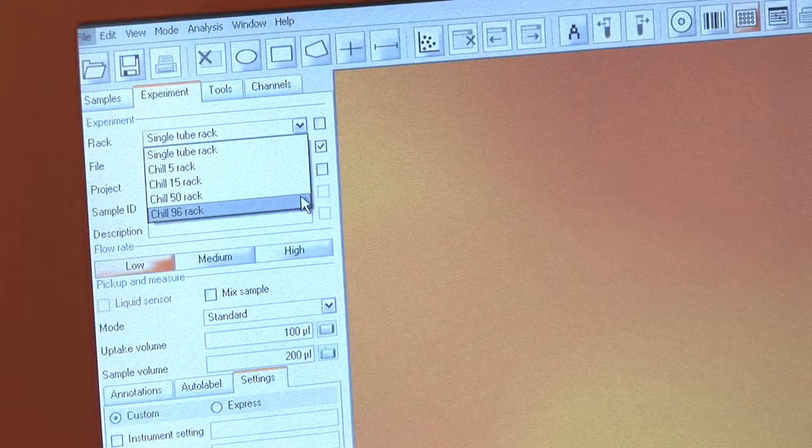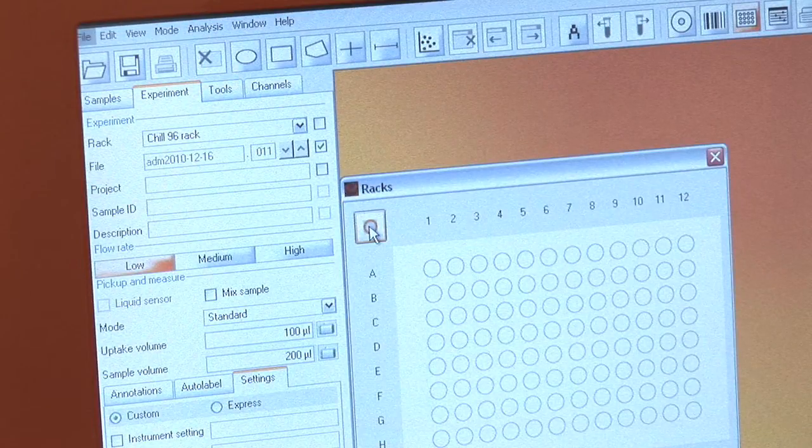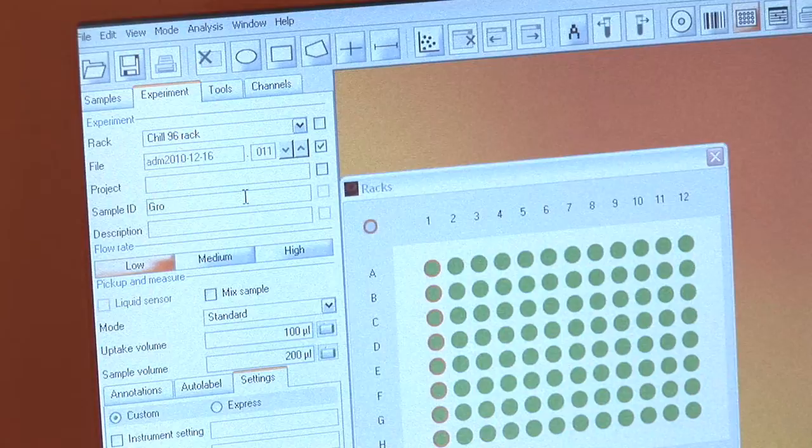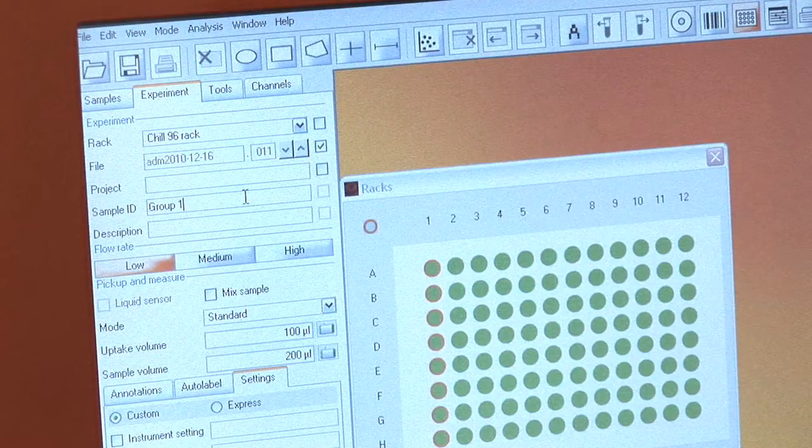From the Experiment menu, select the 96-well rack option and define the experiment details, such as the sample ID for each rack position.